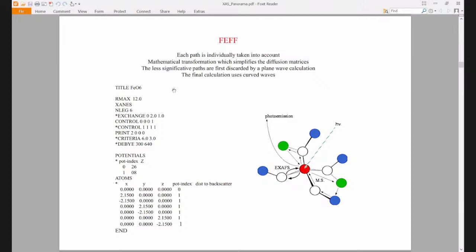And what it's doing in a complicated case like that, Jean Rehr found an algebraic way to split the path at the middle. So each path is divided in two. Then it is scattered by C1, and then the next one is scattered, and then it is able to describe all paths around, this one, and so on. And then he adds up everything and gives the XAS, the zero order of what is calculated by the path.